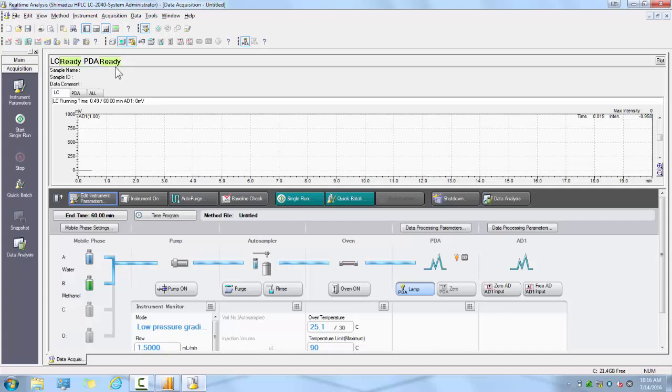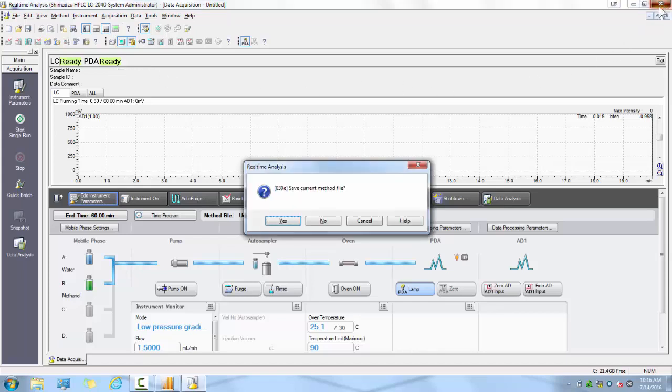If you ever have any issue with your instrument and PC communication, be sure to check your hardware configuration screen to see what your system is detecting as viewable.